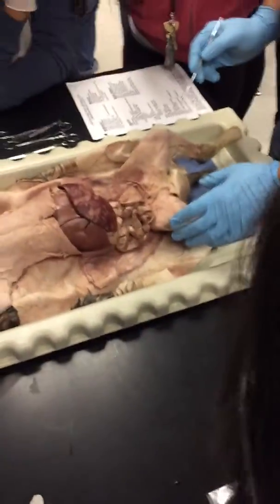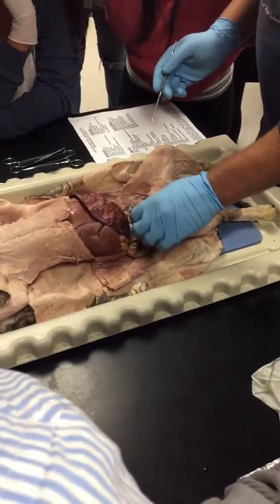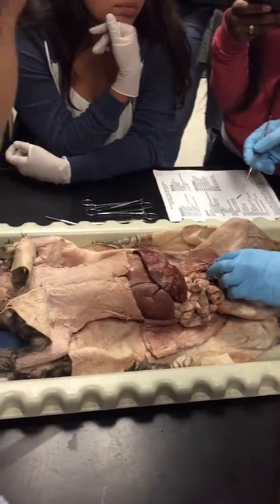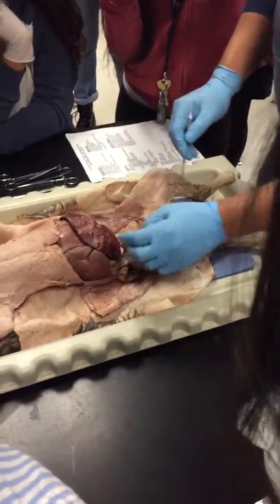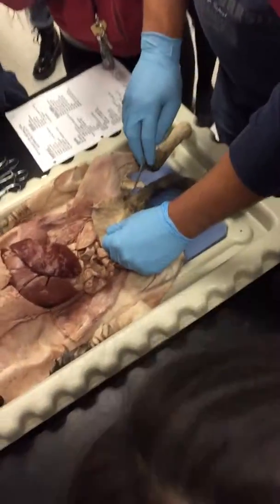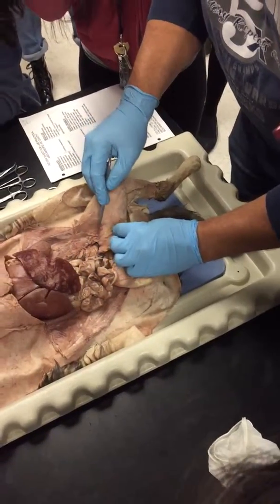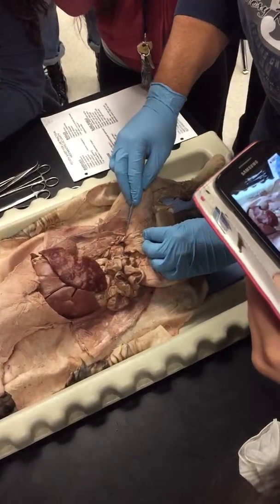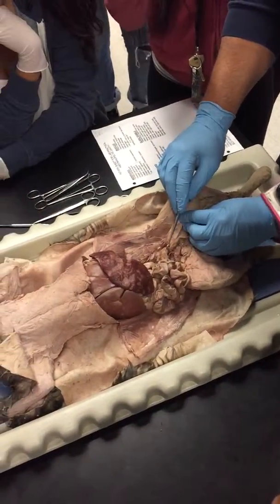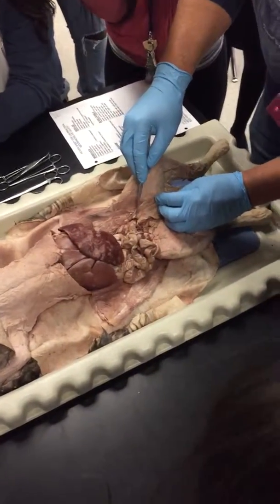Now, remember that I took the adrenal glands off, okay? And this is a male kitty, so we don't have any uterine horns, ovaries, or vagina. But we do have penis, scrotum with 2 testes inside. And then we have these little tubes right here, which are called? Okay, or what's the other name for them? Vas deferens. Okay, so that would be right here.